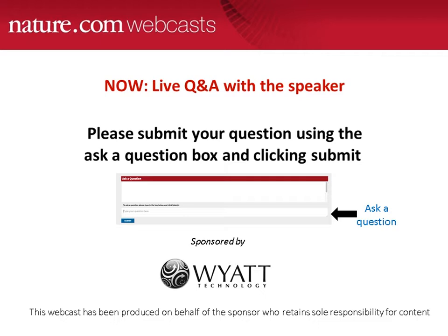Excellent, thanks Eva. And our next question asks, do you need to check protein quality before running it on SEC-MALS? And are there any solutions you wouldn't run, or do you inject any kind of proteins? So I normally ask people to run size exclusion chromatography in their own labs as the last purification step and submit for SEC-MALS analysis fractions directly off the SEC column. I prefer that the protein is not concentrated after SEC, because those fractions usually are of the best quality.